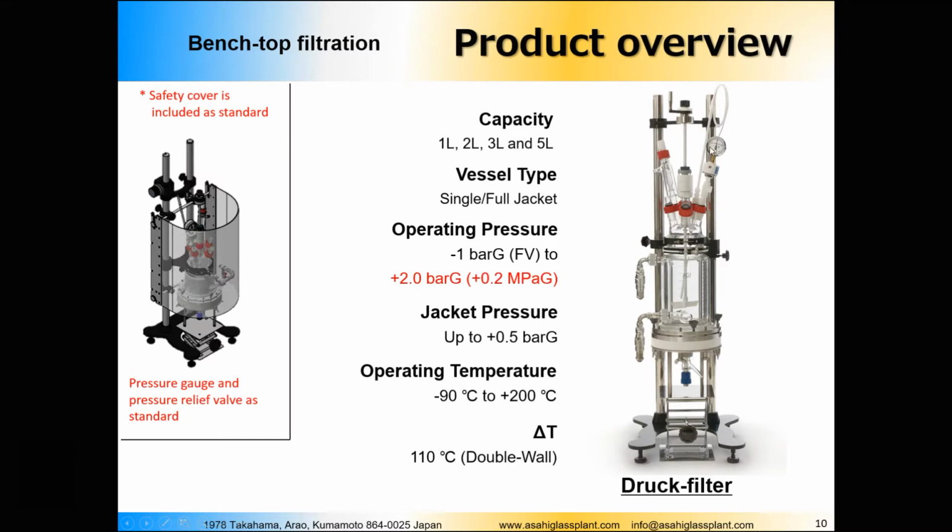And as soon as the pressure goes below 2 bars, again, of course, this glass part closes back and isolates the system from the atmosphere, and so you can continue the filtration.